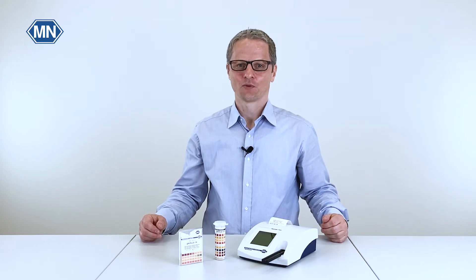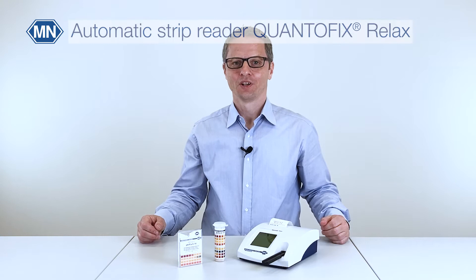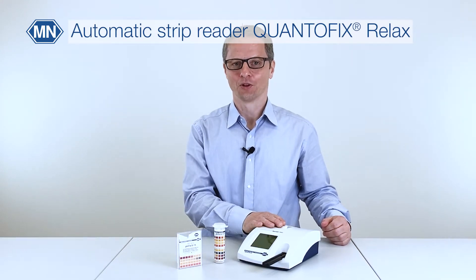Welcome to the second part of our series on pH testing. In this video I will show you the evaluation of pHFix test strips with the automatic strip reader Quantofix Relax.